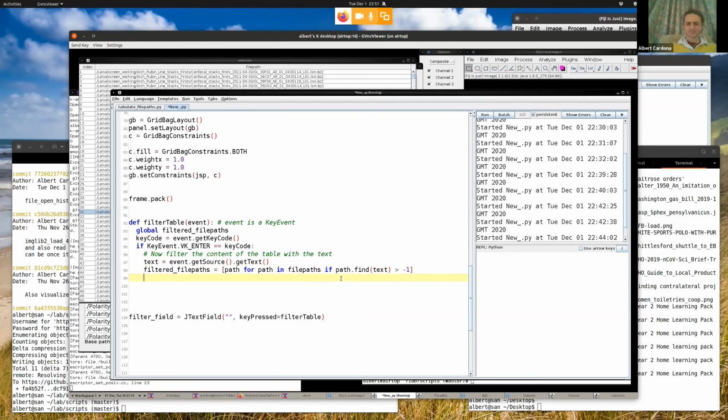So how do we do that? Easy. We're going to build a little function here that says, update table, that takes no arguments. And now this table is going to be called, I think it's updateUI. Right. And so that should trigger it.